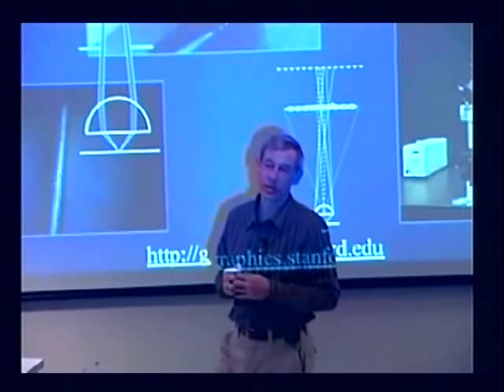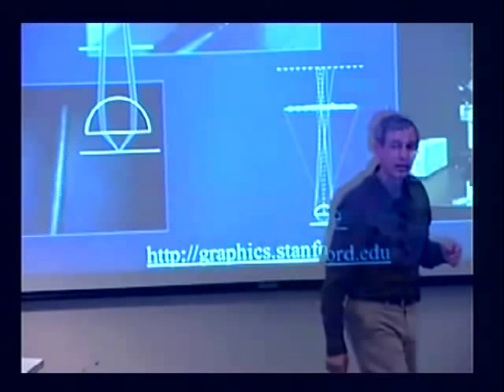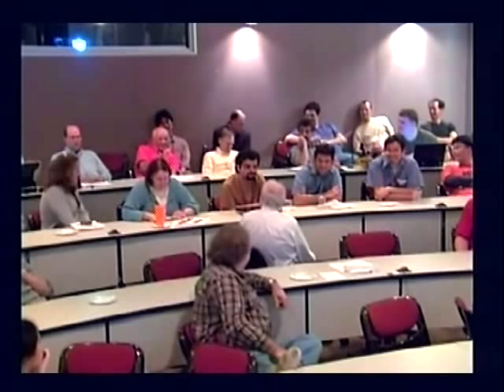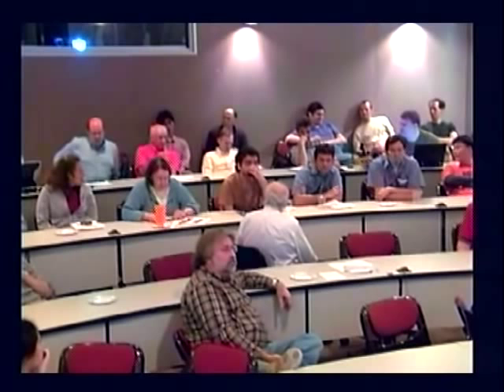Yeah? When I came in, Russell said this stuff was going to be cool, and he was right. Thank you. A microscope is two optical systems, an illuminating system and a viewing system. And everything you've done is in the viewing system.